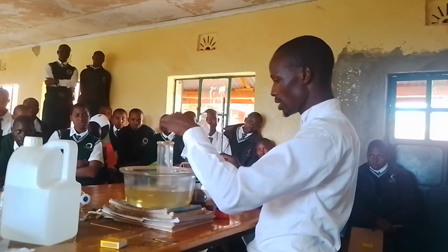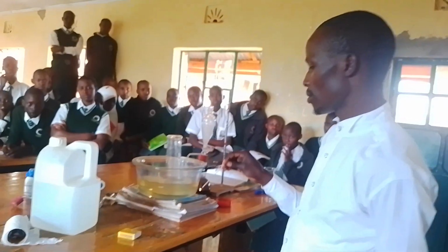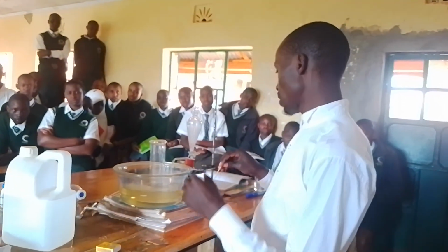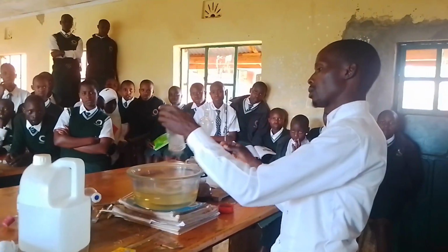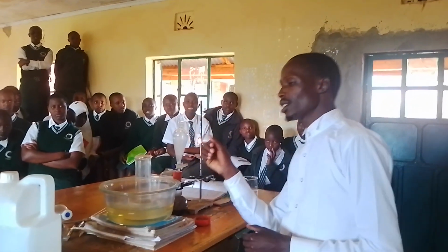I think it is there in plenty. Maybe we can still do our burning splint, our glowing splint, so that we can test it even better. A better one. Are you seeing this? What did it do? Yes? It relights.